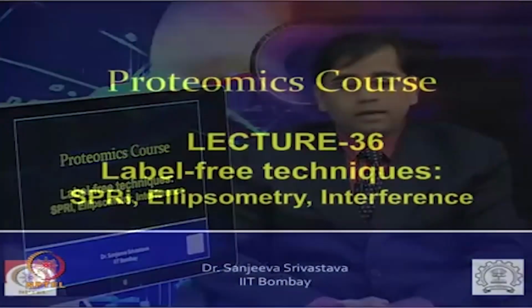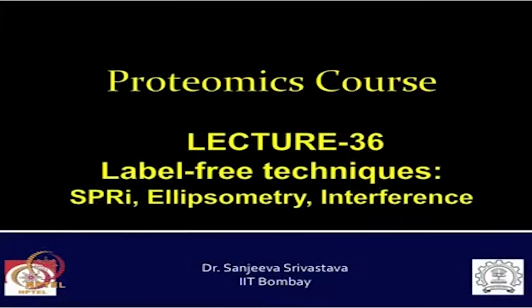In today's lecture, we will talk about label free techniques, which is in continuation with our previous lectures, and today we will focus more on SPR imaging, ellipsometry and interference based techniques.